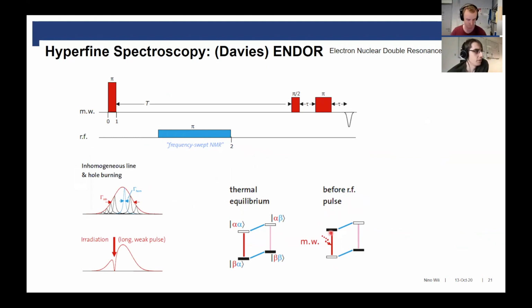And then a final comment from Thomas Schmidt referring to the CW EPR in the first half: you can get distances from CW EPR even if they're small. Yeah, I'm coming to that. Comment on that. Okay, great. On that note, keep going then.